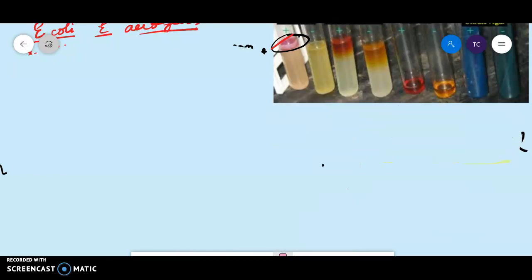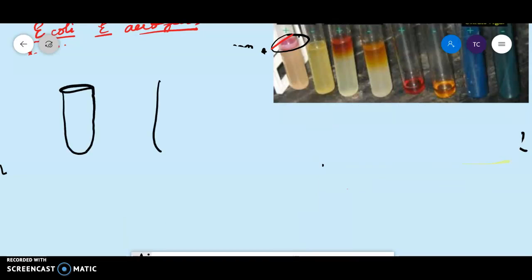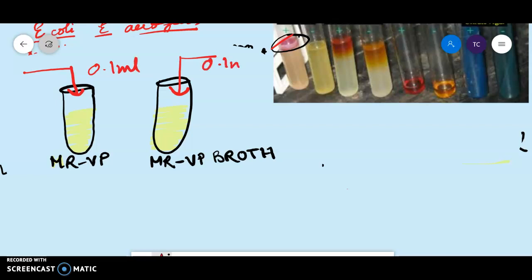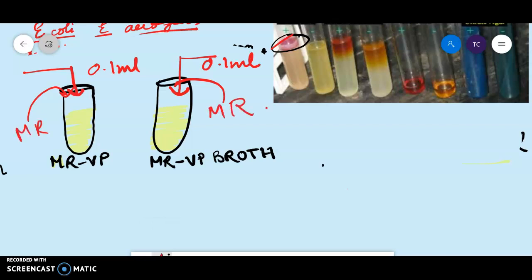For the procedure, you take two test tubes and prepare your MRVP broth. Using an inoculation loop or micropipette, you add 0.1 ml of your culture and keep it for 24 hours. Then you add your methyl red. For a positive result you get a red color; for a negative result the yellow color remains the same — there is no change of color.